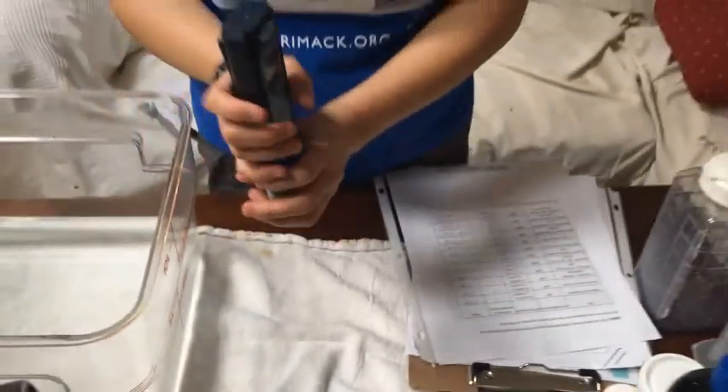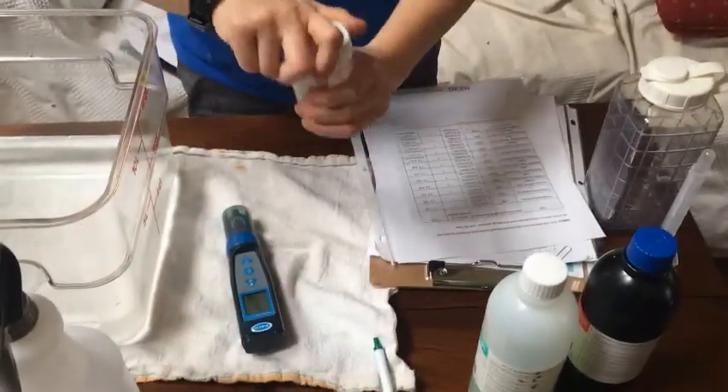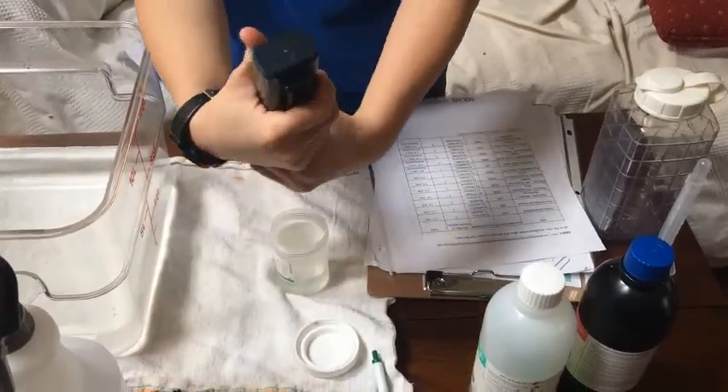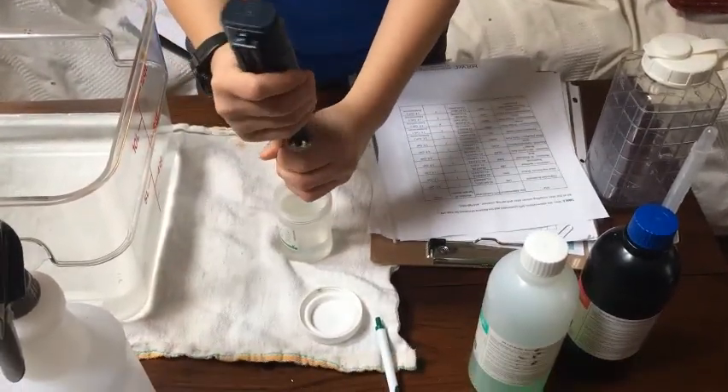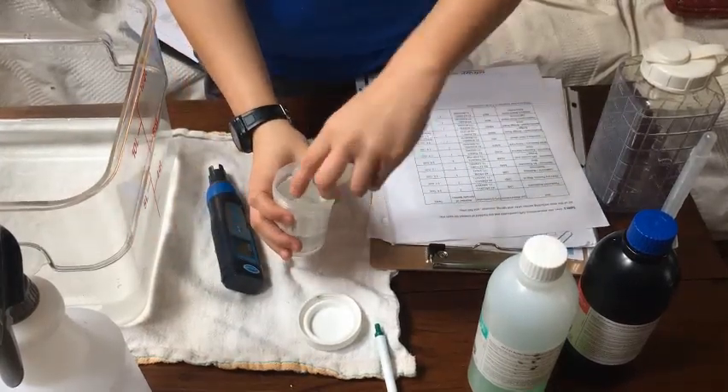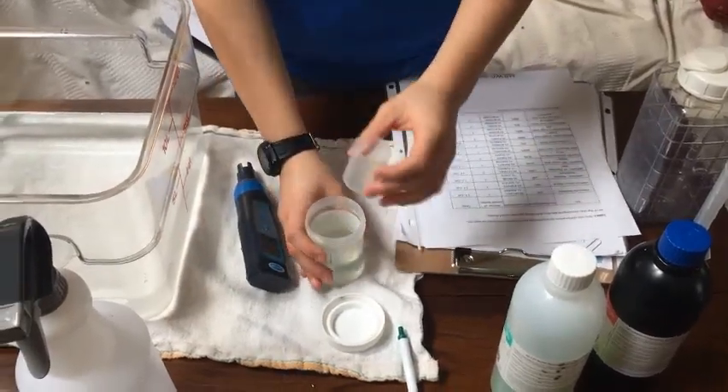You're going to do the same thing with conductivity. The conductivity buffer solution is safe both to touch and is also safe to just go down the drain.